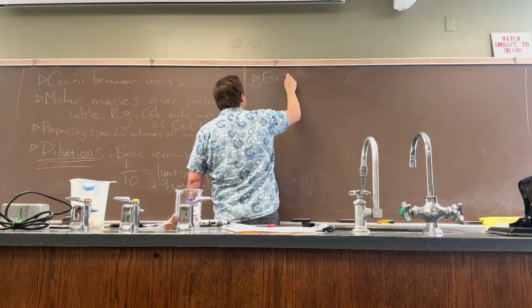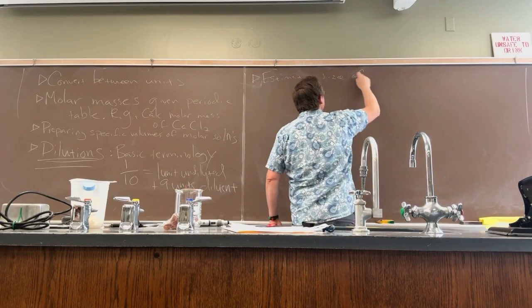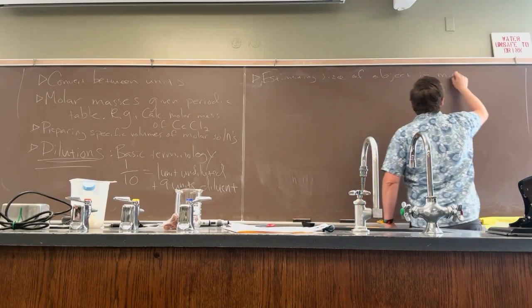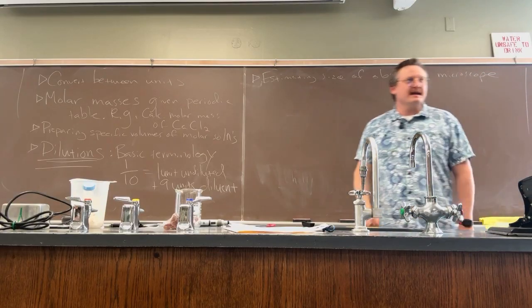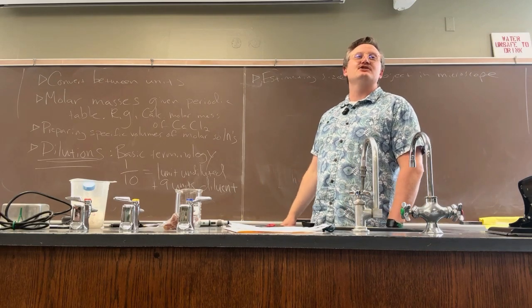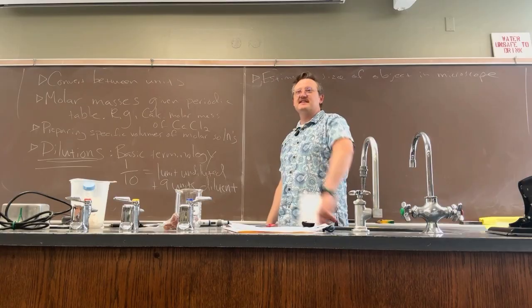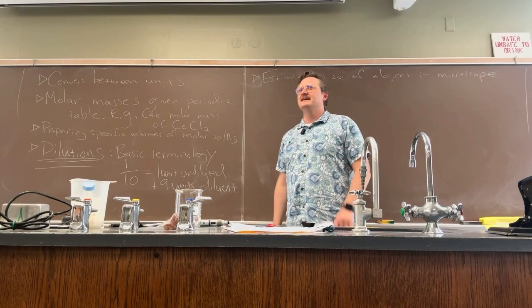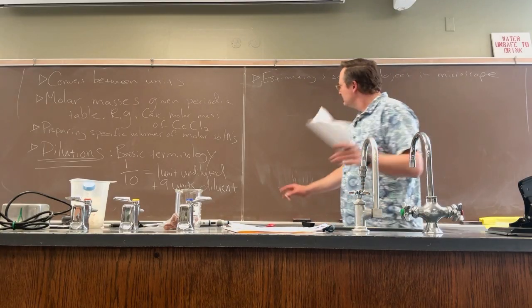Next, estimating the size of an object in a microscope. You got to be able to do that. I'll give you a field of view at some magnification, and I'll show you a picture on your quiz and say, how big is the thing in this field of view at this magnification? It's all stuff that we did, and we had a whole lab about it. Cool.